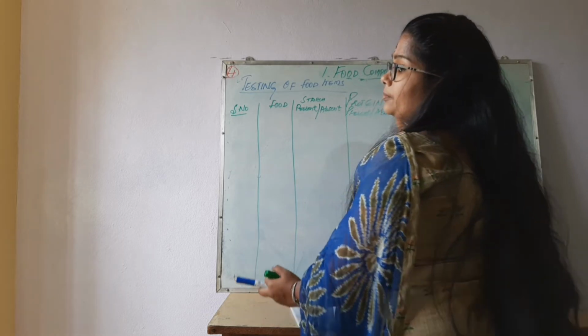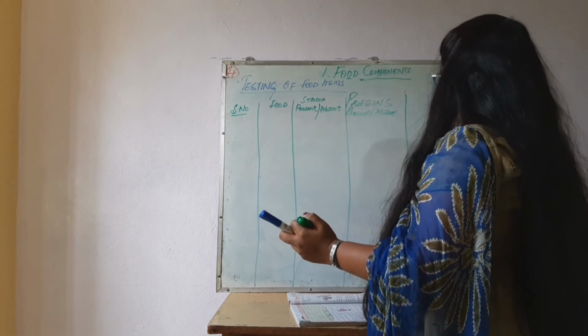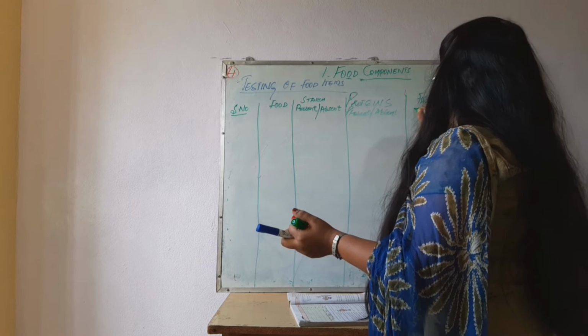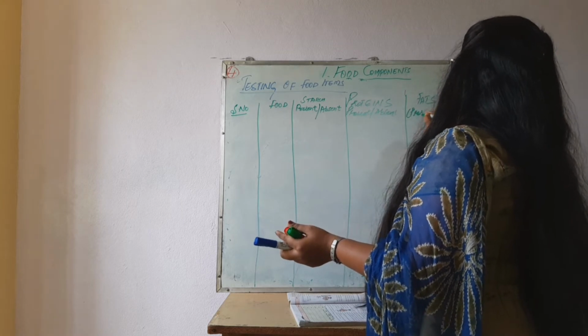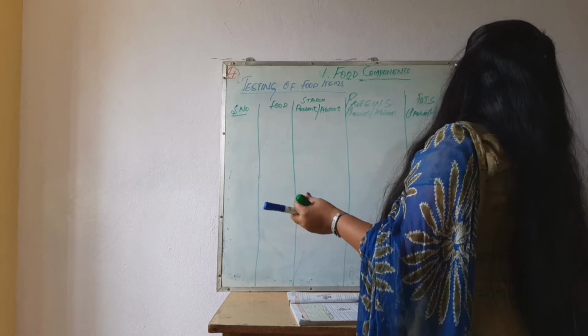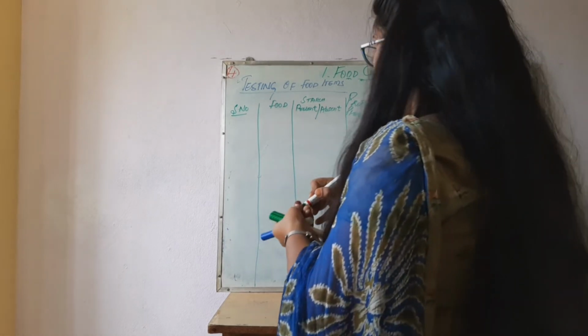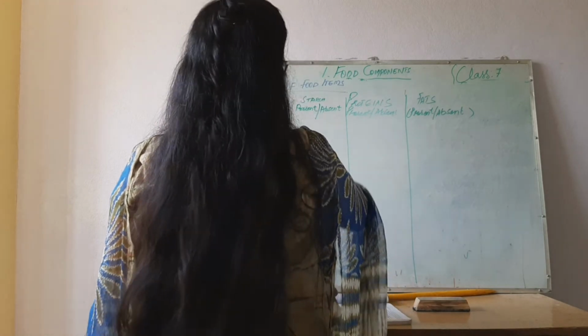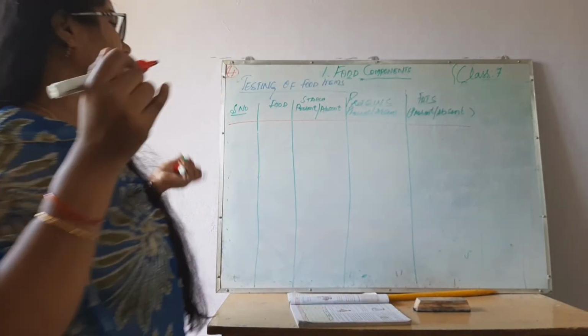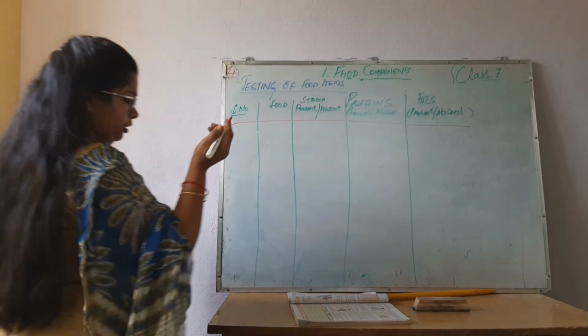Next is fats. Present or absent. For the food items given to you, you have to test with the above experiments to find out what components each food item contains, whether starch, proteins or fats.